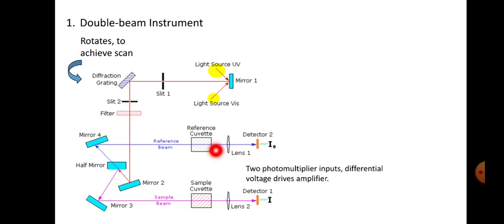And then we have two detectors to detect the amount of light transmitted from the reference and the amount of light transmitted by the sample, and this we refer to as I0. So I0 is nothing but the incident radiation, and I is the radiation transmitted from the sample. We have a readout system, and with the help of the signal processor, the instrument automatically gives the subtracted reading.